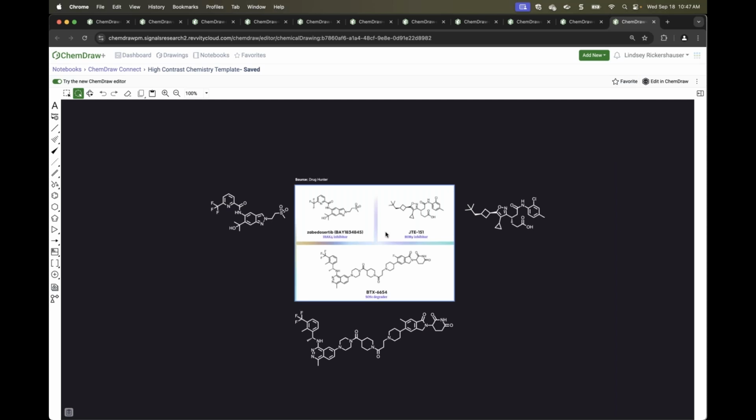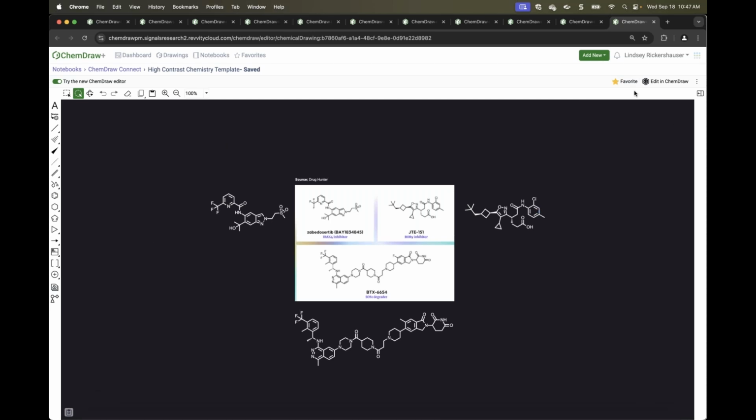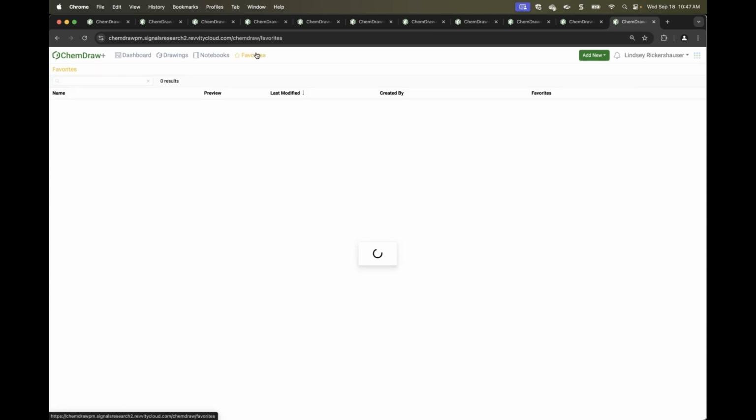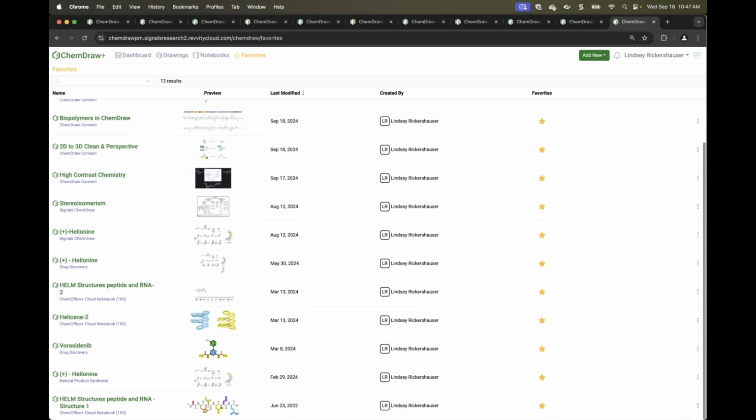Once I am satisfied with what I've done here, if I want to access this from my favorites view, I can favorite the molecule, and now I can come over here. I'm sorry, my drawing, I can come over, and now I can access all of my favorited items here.